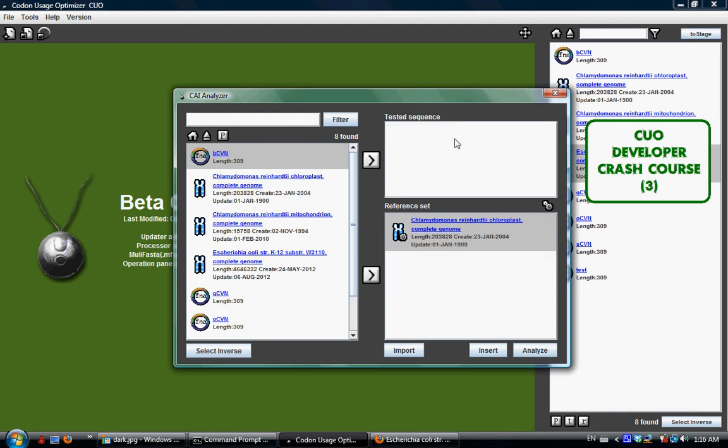Well, it's fine. You can just press the delete key to delete it, and you don't have to have any sequence here. It's perfectly fine because we just carry out analysis of the host genome.